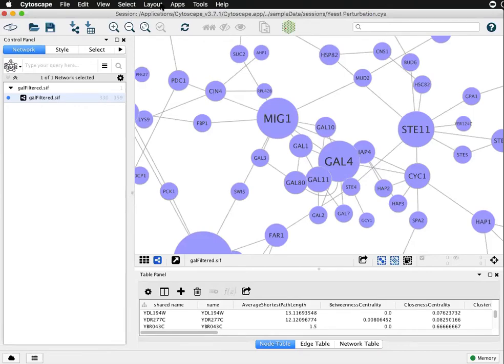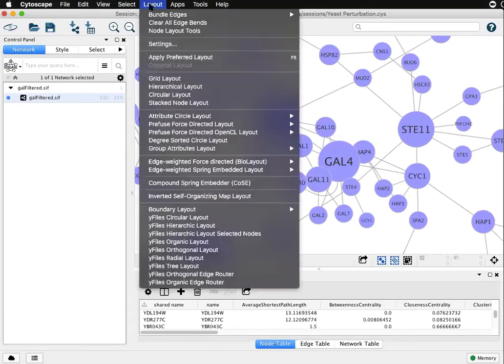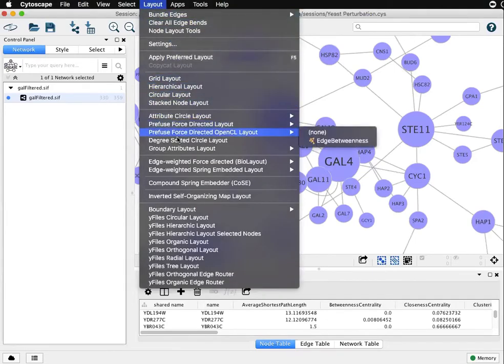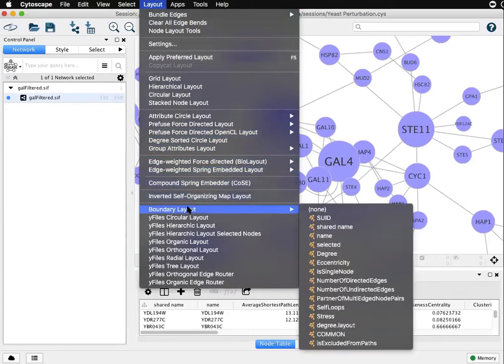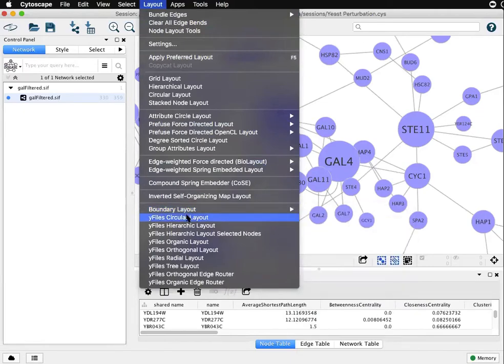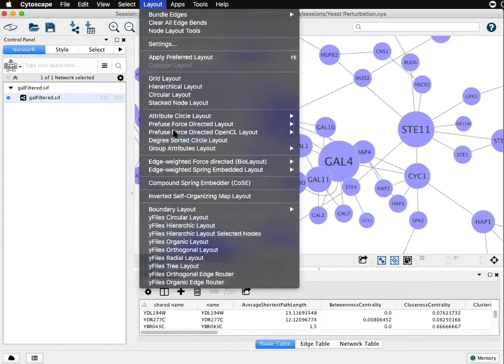The layout menu at the top will show you all the default layouts that are available in Cytoscape, in addition to layouts that come from apps that are installed and a special case for the Y files app which requires you to, upon first installation, agree to a license and then you'll see the Y files layouts in addition.